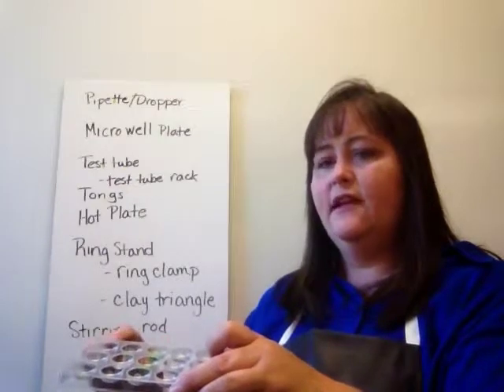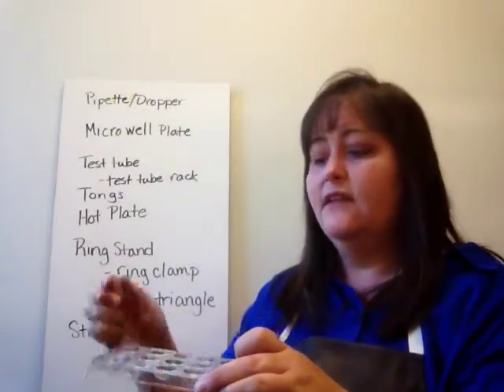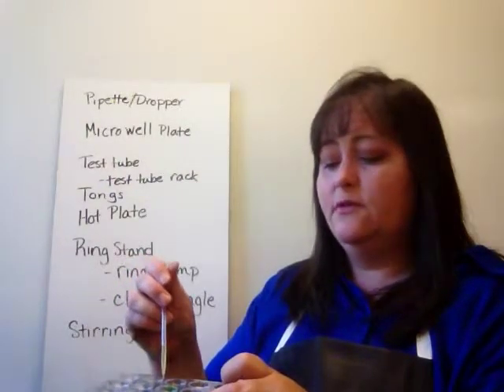These are just small indentations, and the reason we use one of these is to keep from wasting a lot of chemicals by using beakers full of chemicals to react. So we have a small reaction, we can still observe what's going on, but we don't have to use a lot of chemicals to do it.